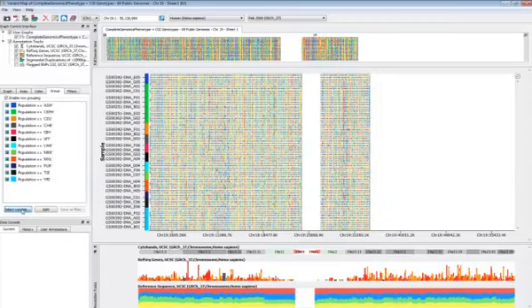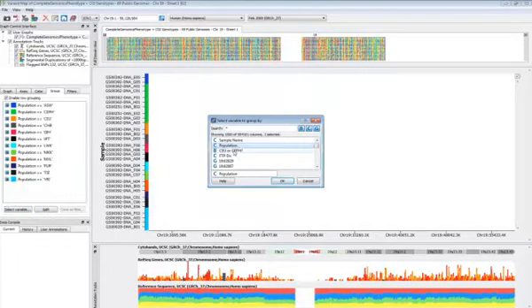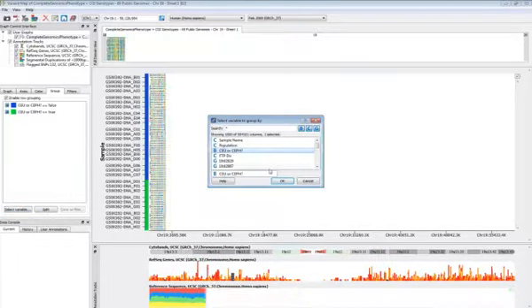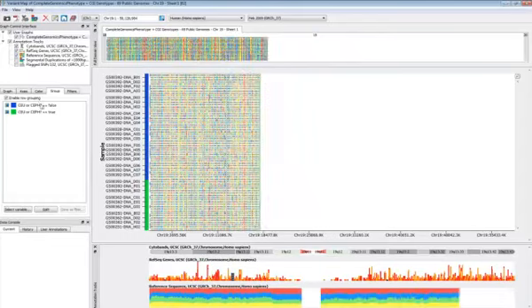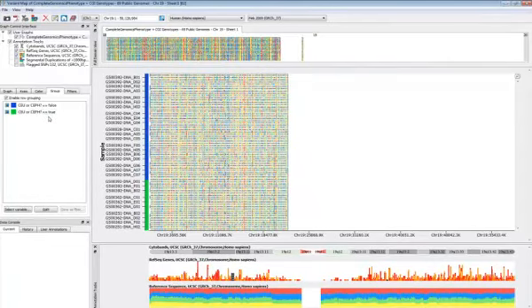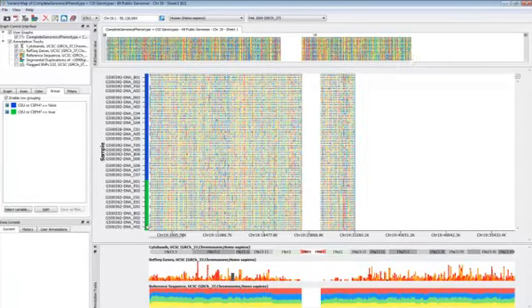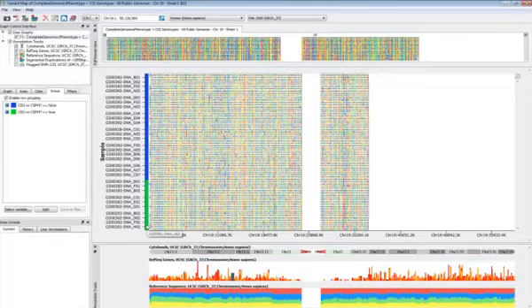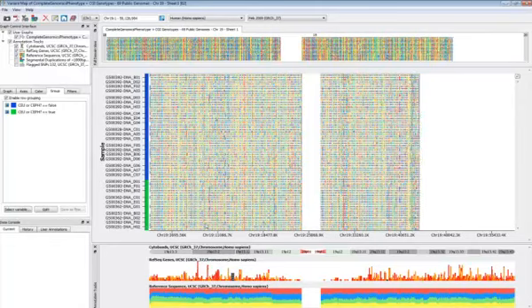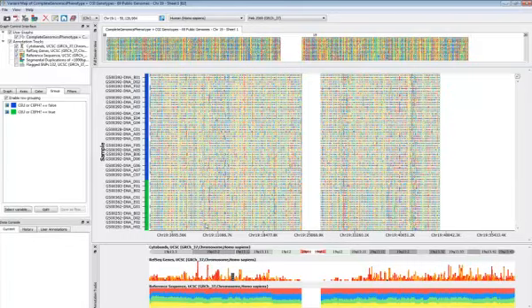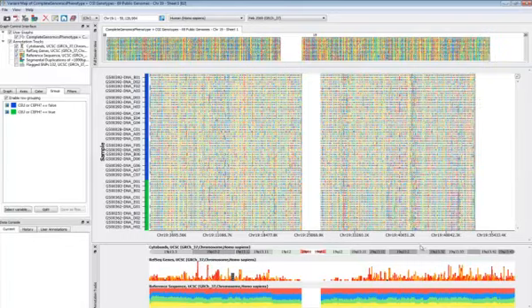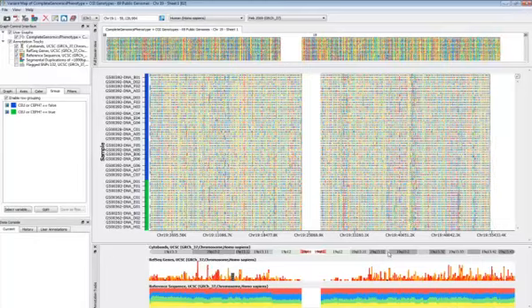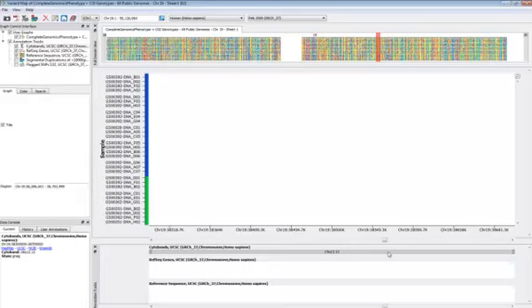We could also, if we wanted, group by a different variable. So we have one in here that just tells us if our subjects are European or not European. We see these green ones down here are the European group. And everything has been resorted. And you can use any grouping variable you like to resort the rows of the variant map.